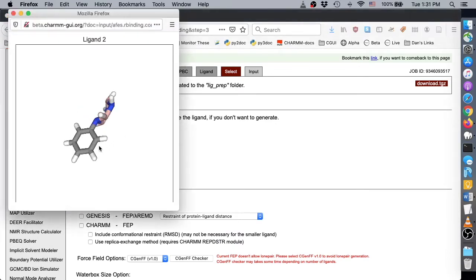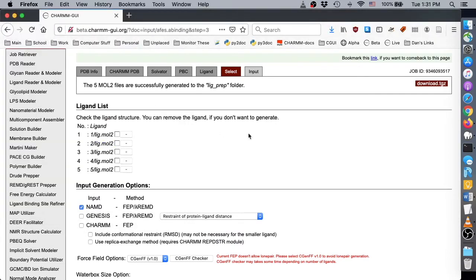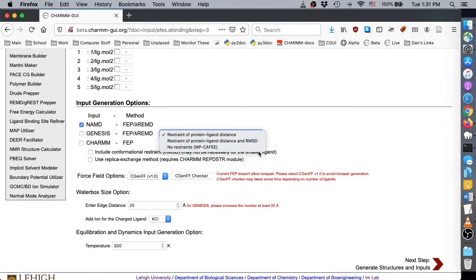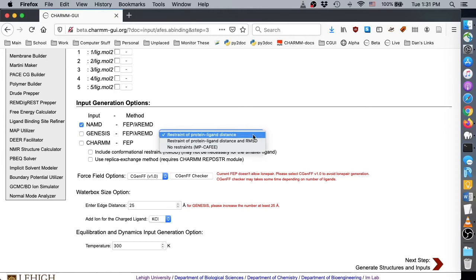Most options on this page are identical to the options shown in the Absolute Ligand Solvator video demo, with the major difference being a drop-down menu to select the type of restraint to apply to each ligand.